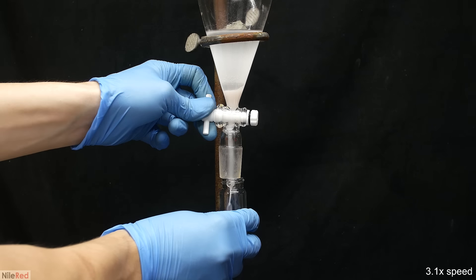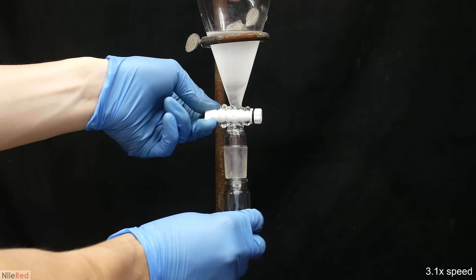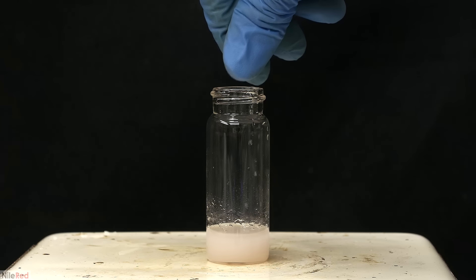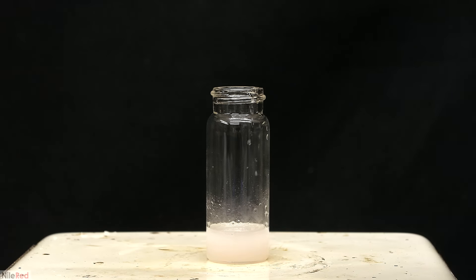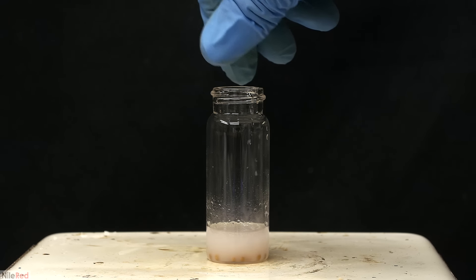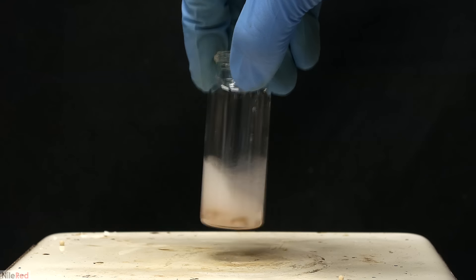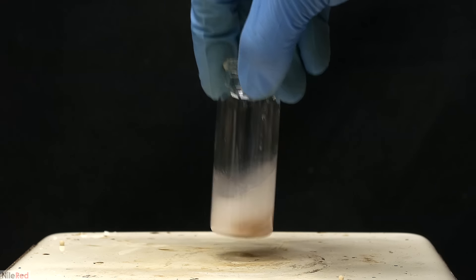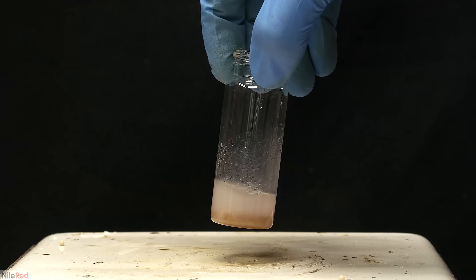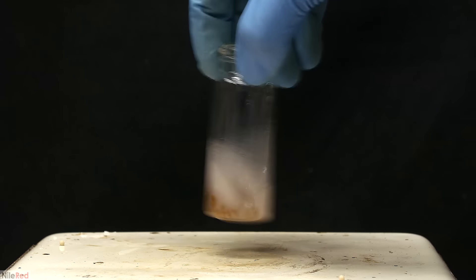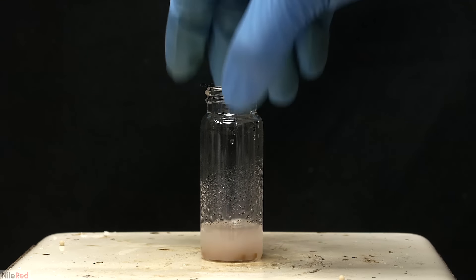Again, I wait for the layers to separate, and then the lower one is drained into a vial. It's very cloudy and wet with water, so to dry it up, I add some molecular sieves. It's also possible to use another drying agent, like magnesium sulfate. I swirled it around a little bit, but it was still a little bit cloudy, so I left it for a couple hours.